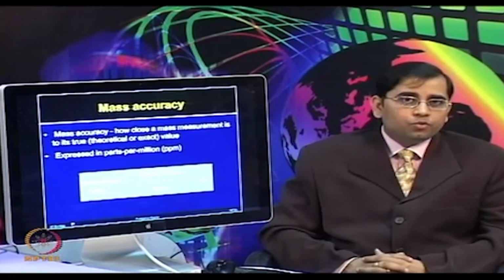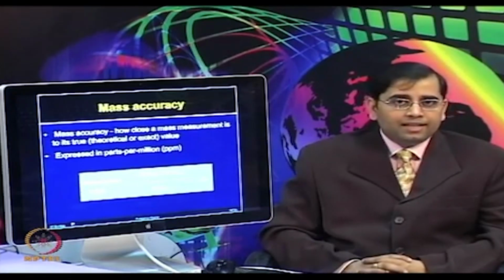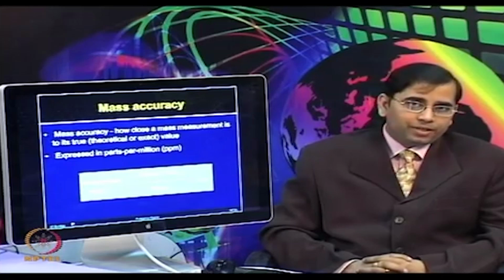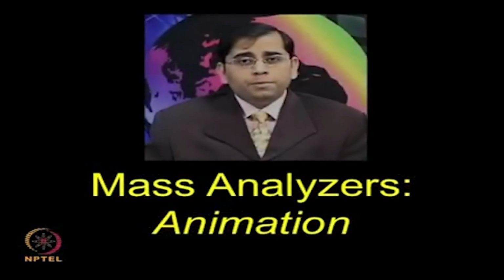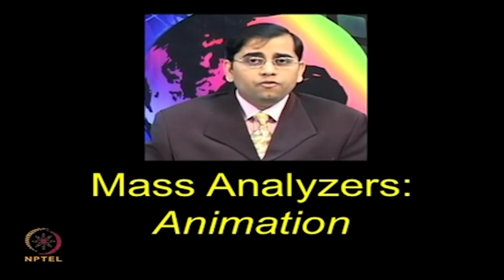Now, currently there are many mass analyzers which can measure both in MS and MS/MS mode with less than 1 ppm mass accuracy. So, let me show you a few available mass analyzers in the following animation.